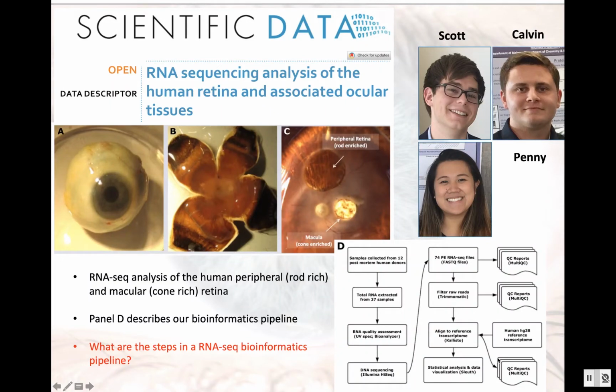Hello, this is Ray Enke at James Madison University, and I'm going to give a short video overview of how to set up HISAT2 alignments for eukaryotic RNA sequencing using the CyVerse Discovery Environment.